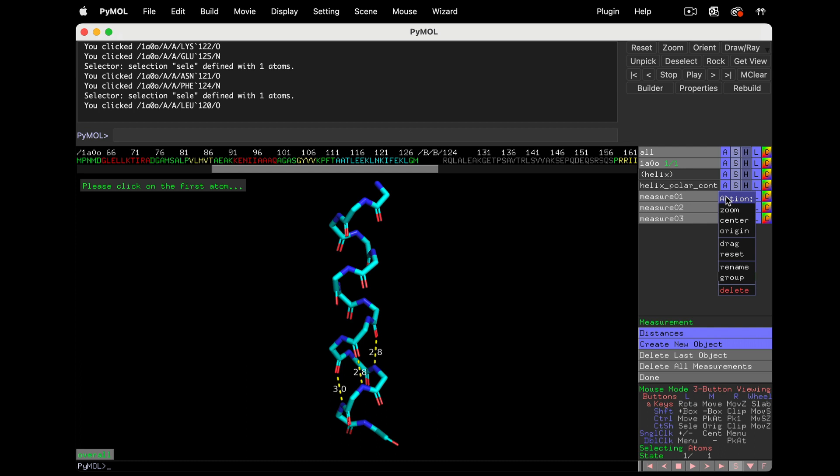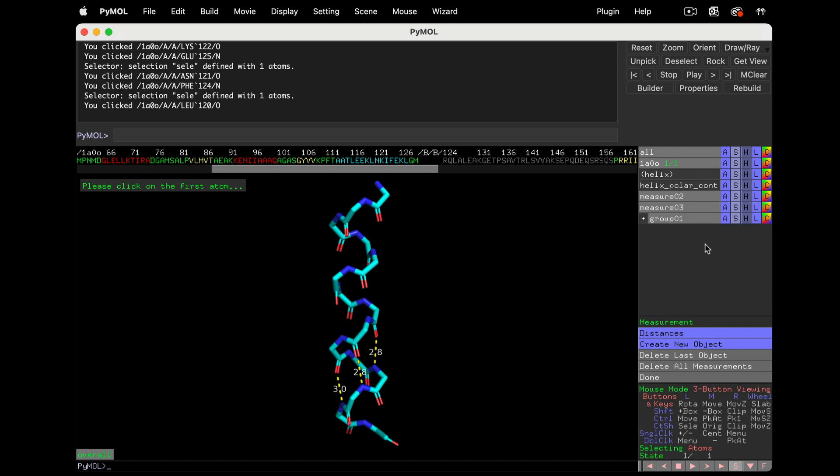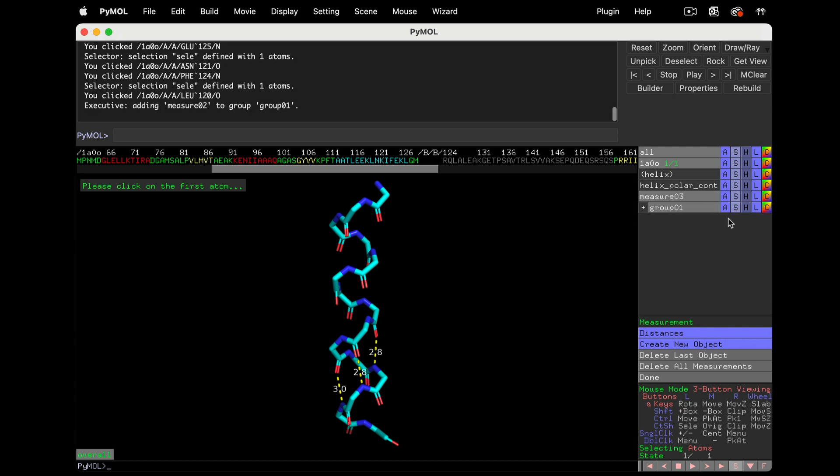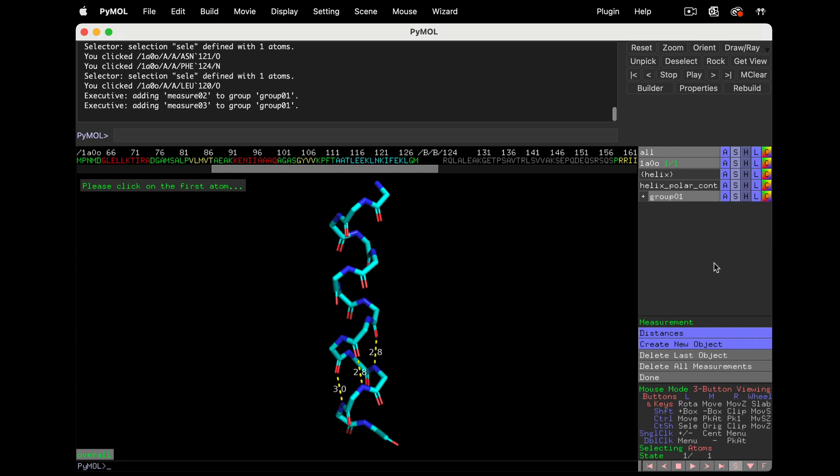When we deselect the main chain polar contacts, we see the I plus 4 interactions we've measured. If we measure the whole helix, there are going to be a lot of measurements that fill up the whole names panel. We've got a couple options to neaten this up. You can group objects in the names panel. So let's take Measurement 1, Group, New Group. Now let's add Measurement 2 and 3 to the group. Now we can operate on the grouped objects together.